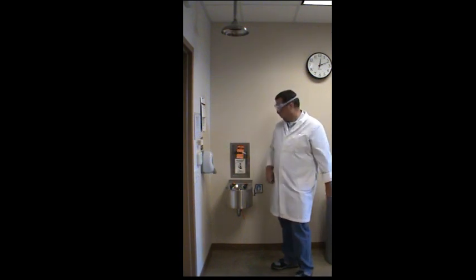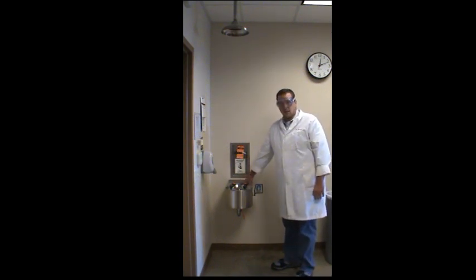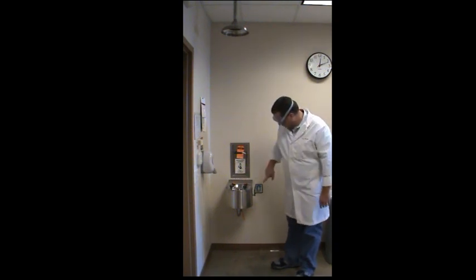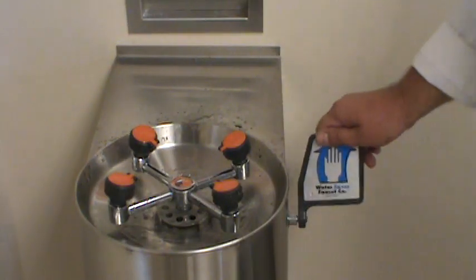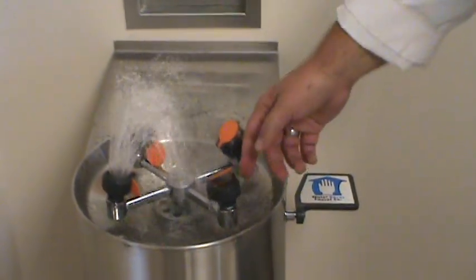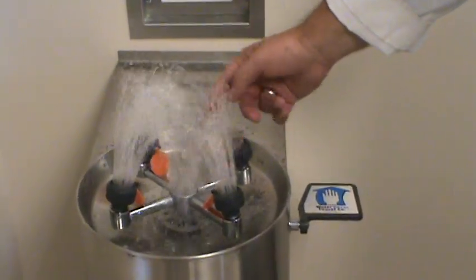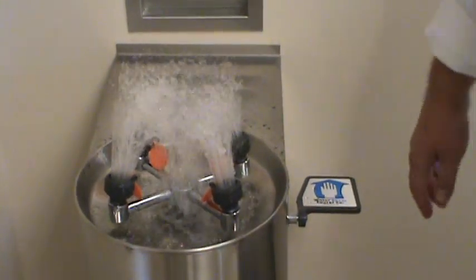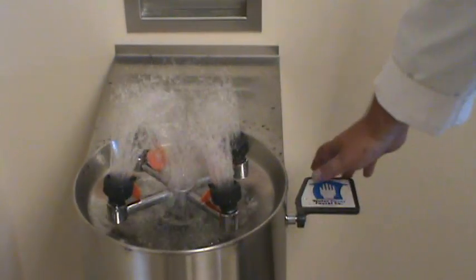In the front corners of each lab, you'll find an eyewash station and a safety shower. To operate the eyewash station, just push the handle and all of the covers should open up. If they don't quite make it, you can give them a little flip and your eyewash is active and ready to wash out your eyes.